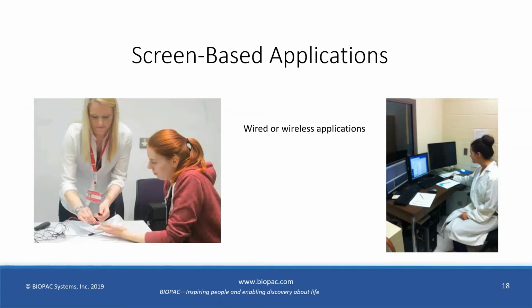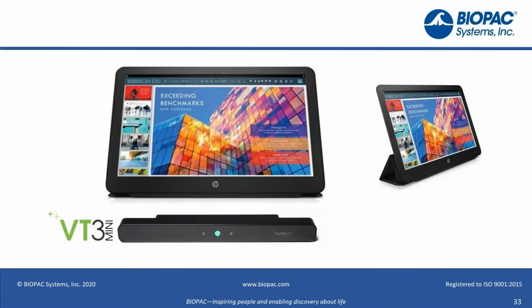So as Keith's already explained, the eye trackers are designed for screen-based applications. These are portable, so they can be used in or outside of the lab. The bars are lightweight, and the second display can be really quite small as well. I'm actually using a Hewlett-Packard portable monitor. It's 14 inches, this one, V14. Very convenient. It stands up on its own little kickstand, and then the eye tracker just is mounted beneath the display.